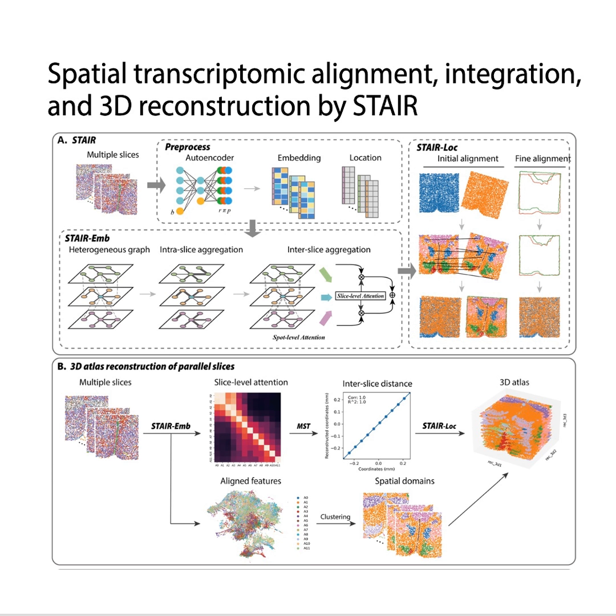This score measures how much the entirety of one slice contributes to the structural definition of another slice. It's capturing these higher-order semantic relationships. So instead of just saying, this spot looks like that spot, the system can say slice A as a whole is functionally very similar to slice B, and that structural continuity is really important. That's it. It's capturing the global organizational patterns. And that slice-level score becomes the absolute linchpin for everything that follows, as we're about to see. So let's look at the evidence.